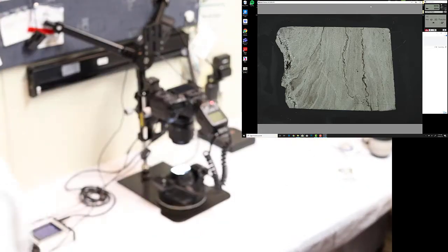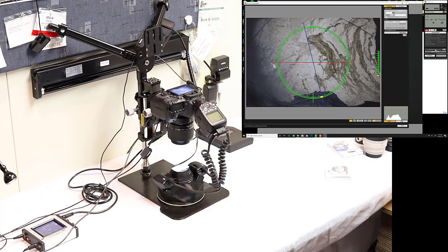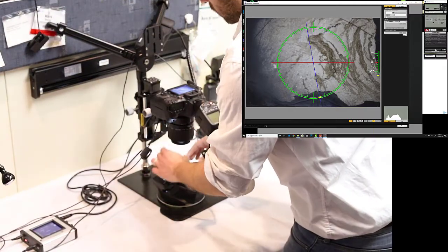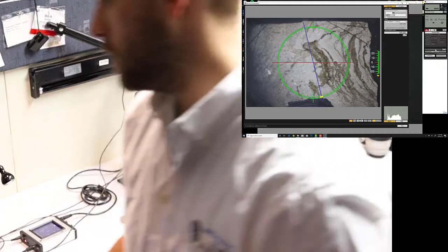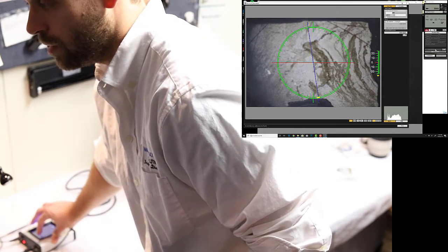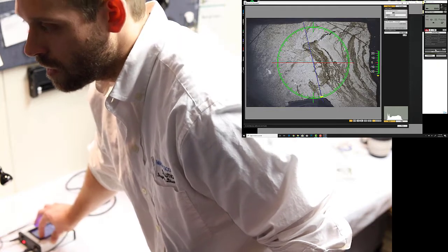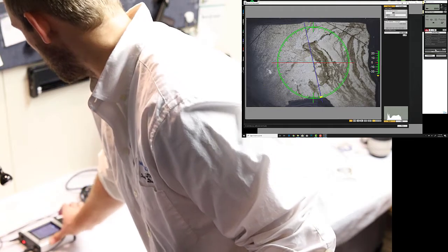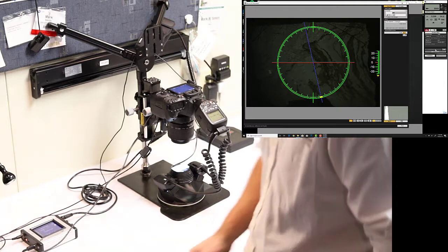We'll come back over here to the computer, open up our live view shoot. In here, we'll want to center the slide. Okay, we're still polarized. We're going to change our starting and end point just to make sure we're all the way through here. So we're just out of focus. That'll be a start point. Come through. So we're just out of focus once more. That'll be our end point. We'll come back to the camera, set it back up to manual.